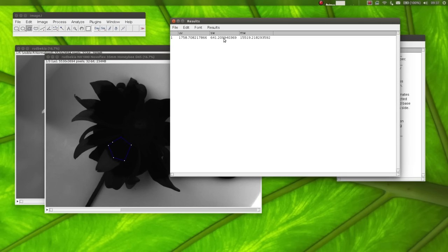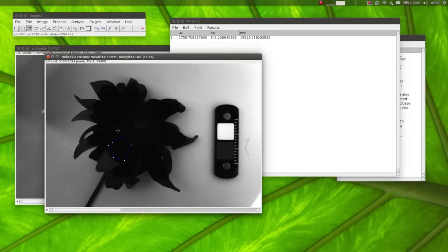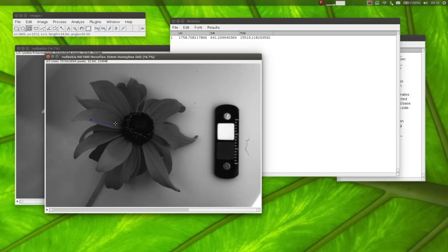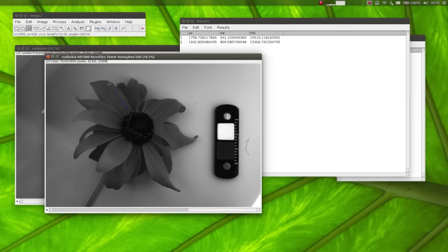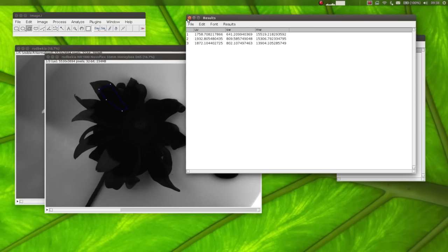These values are on a 16-bit scale, so that allows you to save the image as a 16-bit TIFF if you want. That means the top of the range here is 2 to the power of 16, that's 65535, scale minus 1. So if you want to get reflectance values, for example, then you'd need to divide these numbers by 655.35. And you can measure multiple areas with this tool, so I'll just select another leaf, for example. And then once you've loaded this tool, just press M and it will measure that bit for you. And again, I'll just select another bit, press M and it measures it. There we are.